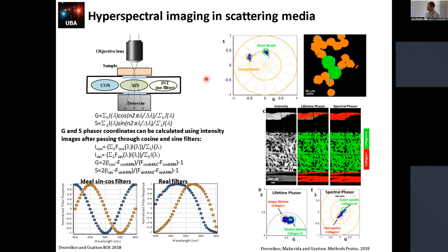And you can see that if we do that and we do the proper calibration of mathematics, we can capture these beads with two colors, and you can capture the green, which is less modulation, and the orange, which is high modulation, higher phase. And of course, if you look carefully here, you see some little dots which are the pixels on the frontiers between one bead and the other, which are the linear combination.